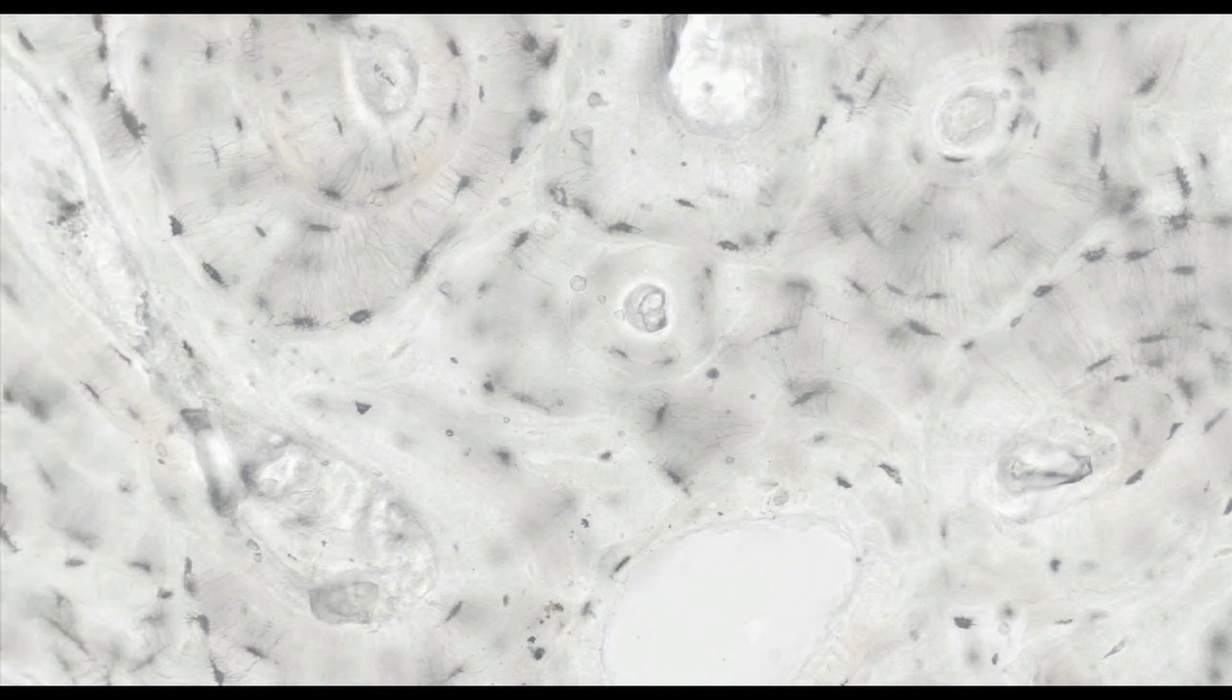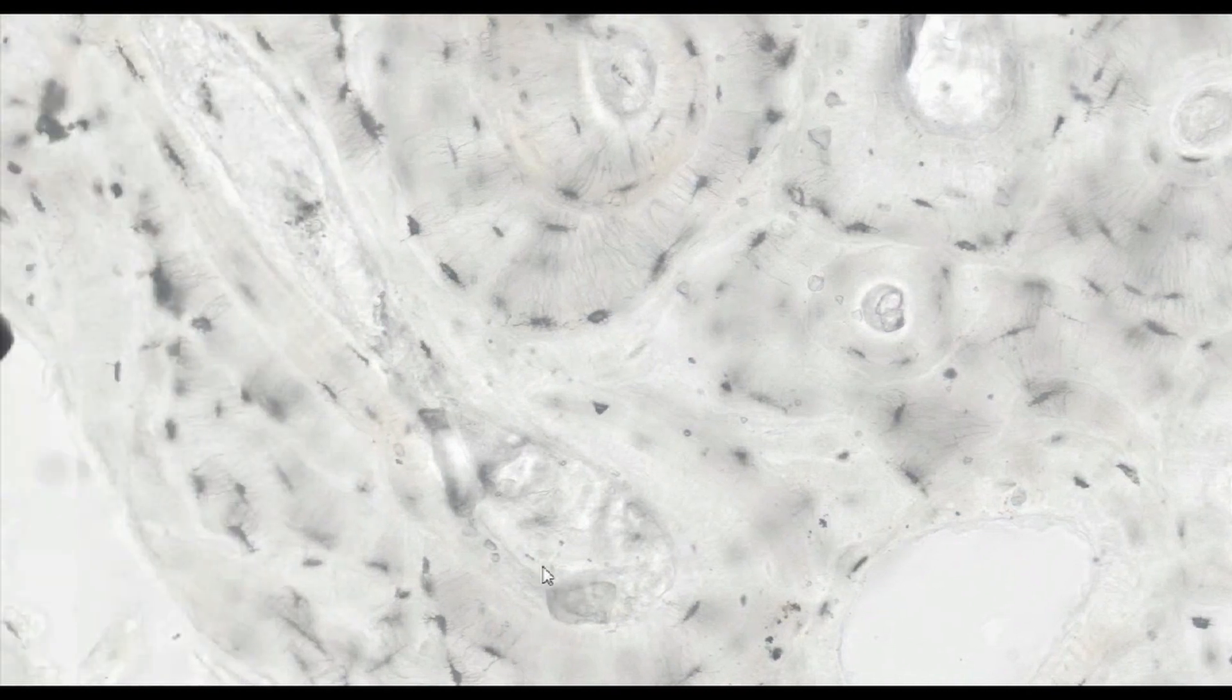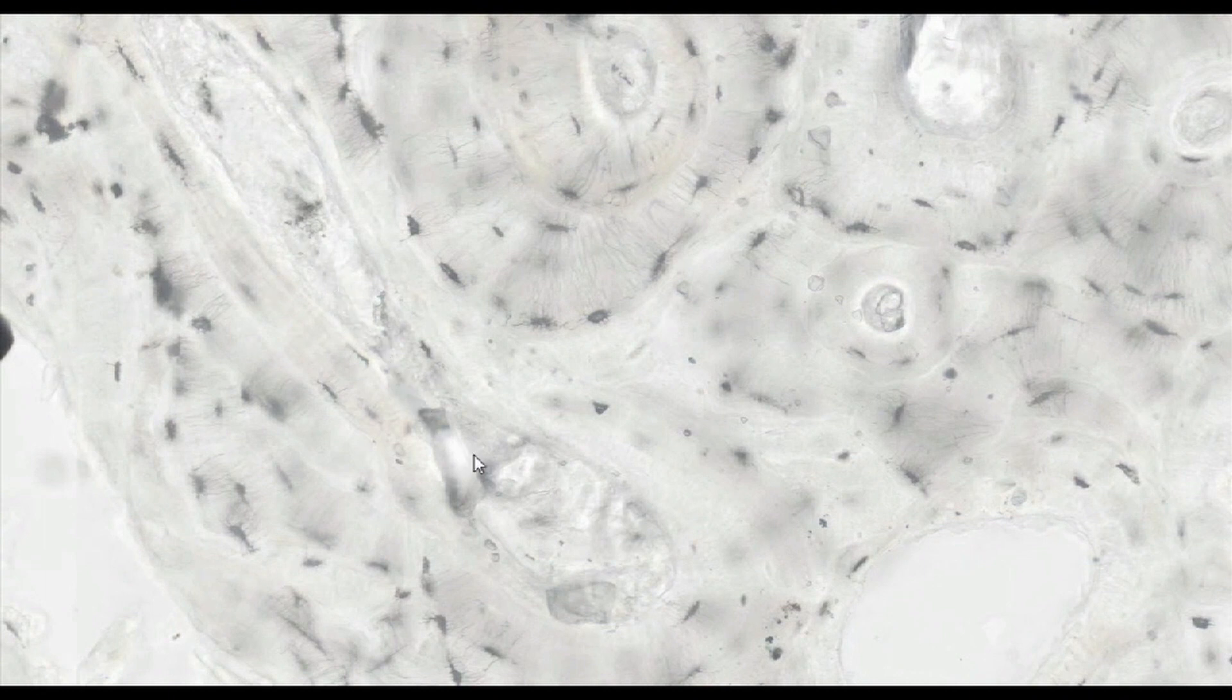Volkmann canals penetrate the bone across the Haversian systems. These are wider vascular canals penetrating the bone from side of the periosteum and or the marrow cavity.